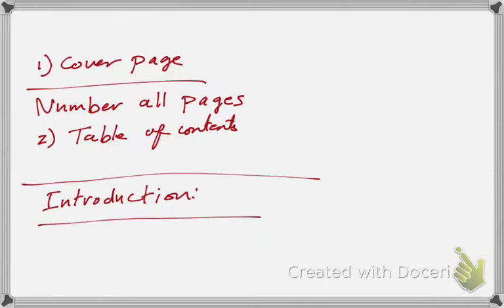Then after that, in a new page, you're gonna start part 1. In part 1, every part you start, I need the objective. And the objective, if I want to simplify it for you, is what I did and why I did it, right? So in part 1, we screened the red dye against the visible spectrum so we can find out the best wavelength that has the highest absorbance and lowest interference.